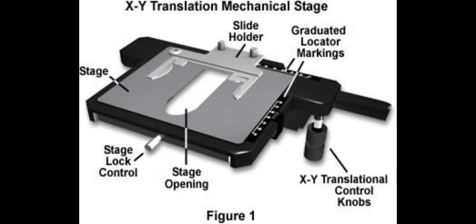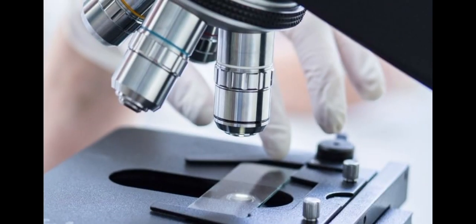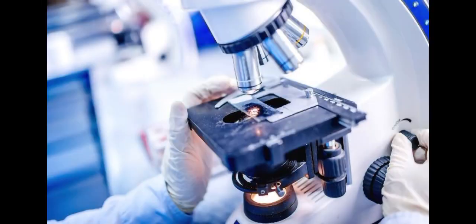Seven. Stage. The specimen is displayed here. The specimen slides are kept in place by stage clips. The most popular is the mechanical stage, which enables control of the slides by allowing them to be moved mechanically on the stage rather than manually.